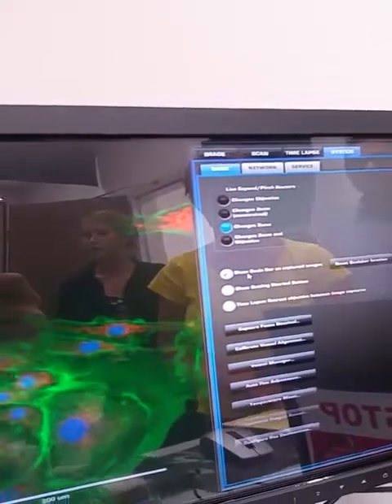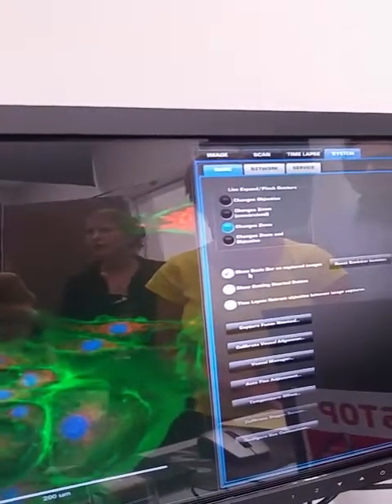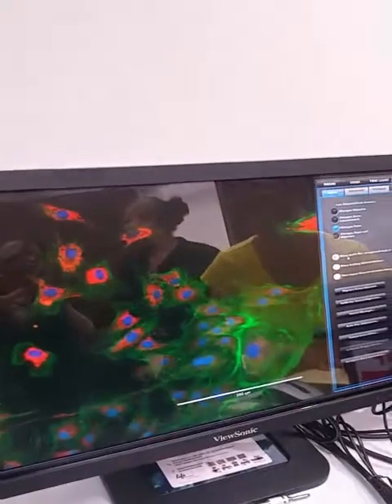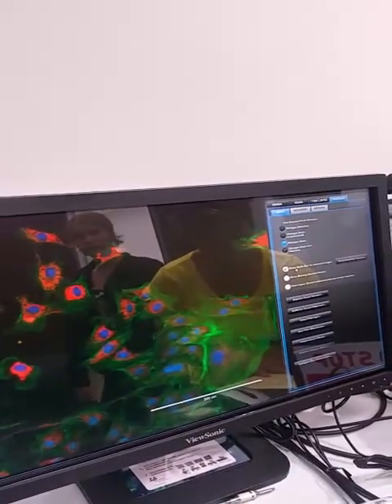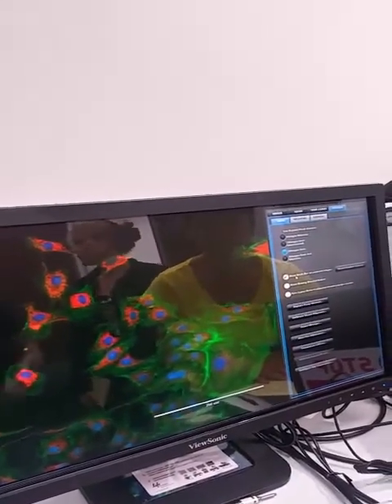There's accuracy for each objective, so you can use that as a reference tool. You just click on it and it shows it. If you save it with burn-in, what you can do is save one with burn-in and one without. And if you wanted to change it, you can use that as your reference.